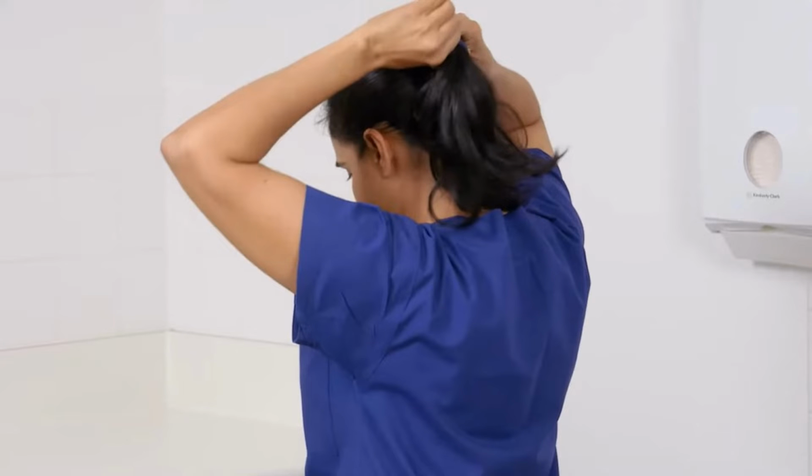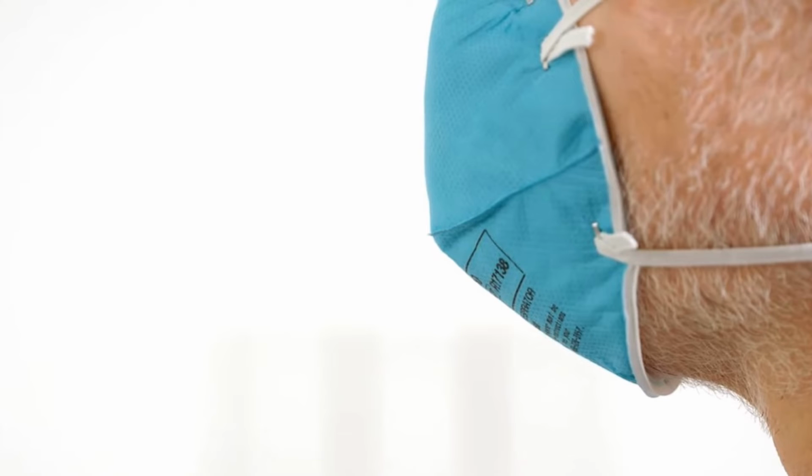You need to ensure that your hair is secured back. So any hair that gets between the mask and your face will not allow for a proper seal and will allow air containing virus particles to come through. Again, as previously mentioned, any hair between the face and the mask will not allow for a proper seal. And because of this, you need to be clean shaven to be wearing a P2 or N95 mask correctly.